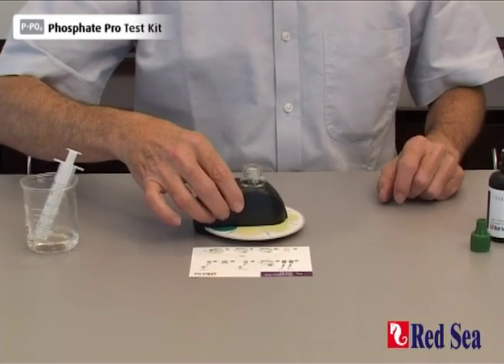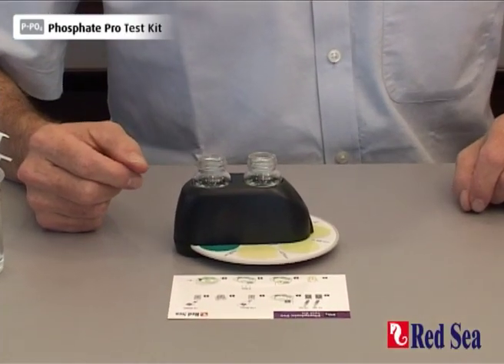We now set our stopwatch for six minutes, which is the time it's going to take for the reaction to be ready.